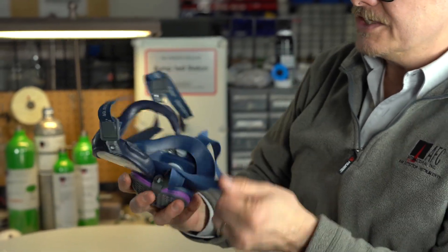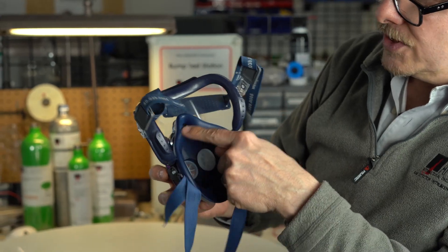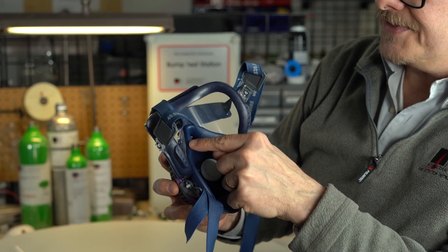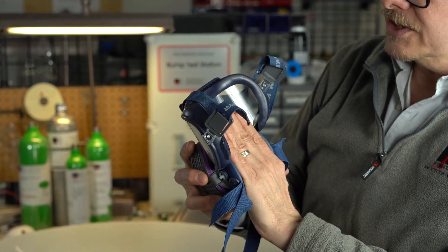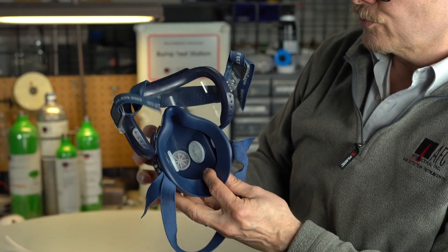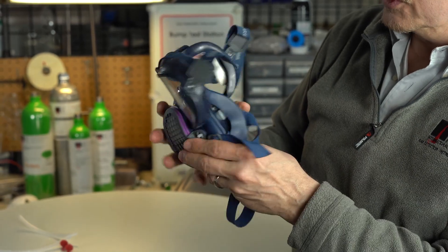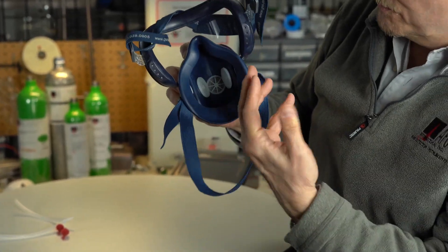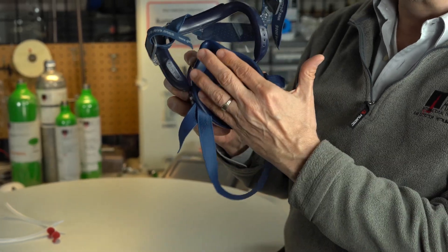On the inside you will see it is a traditional half-face respirator, so you're getting sealing right here. This is where you're going to want that sealing edge, and that's what's going to create the negative pressure. So when you breathe in through these filters, these little inlet valves right here are going to open up and allow you to breathe in — that creates that negative pressure.